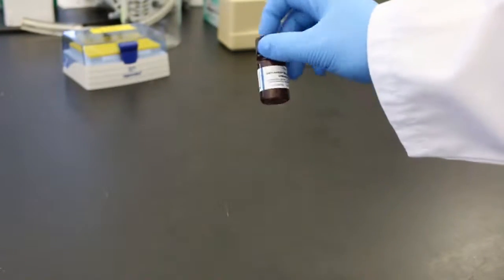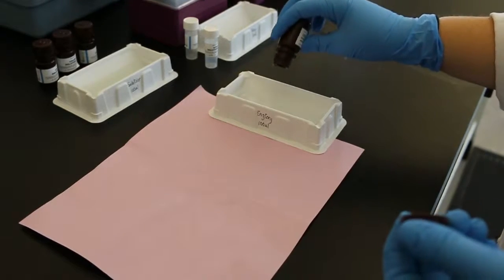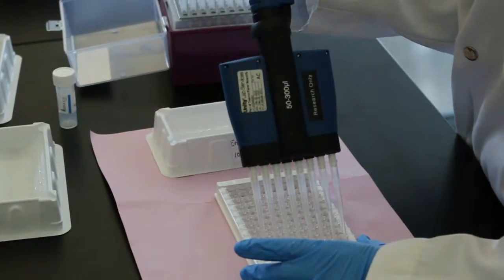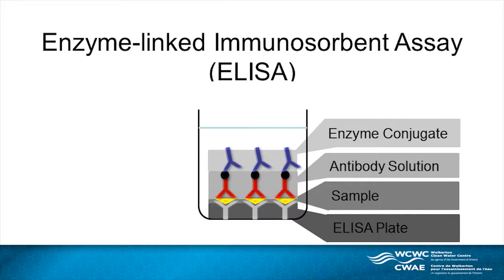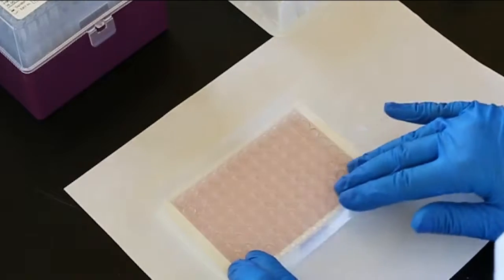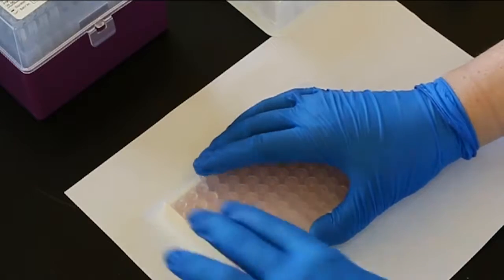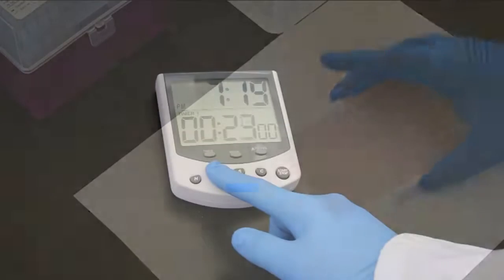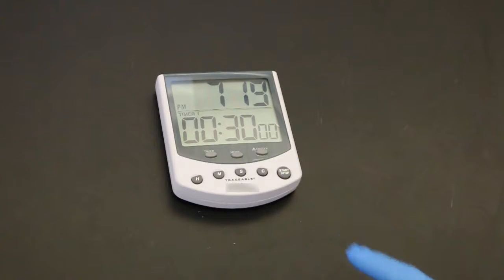The enzyme conjugate solution is inverted several times and poured into a clean tray. 100 microliters of enzyme conjugate solution is added to all of the wells using a multi-channel pipette. The wells are covered again with parafilm or tape and mixed by moving the plate in a circular motion on the benchtop for 30 seconds. The plate is incubated at room temperature for 30 minutes.